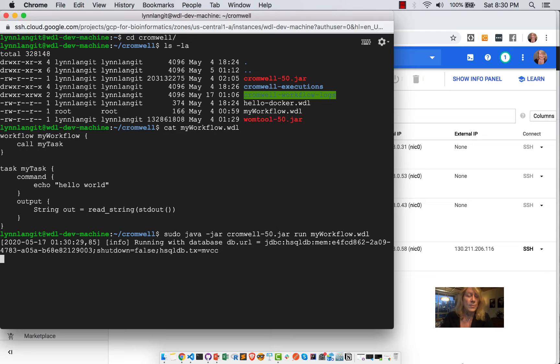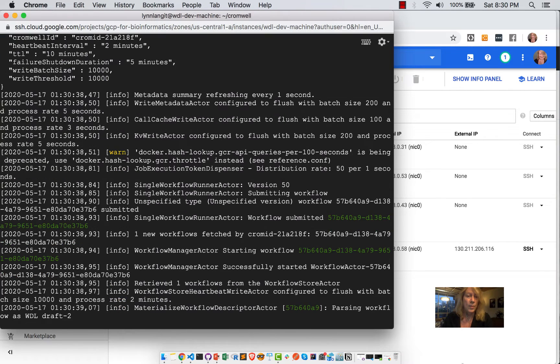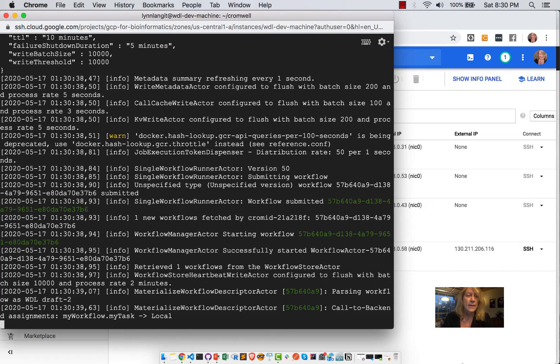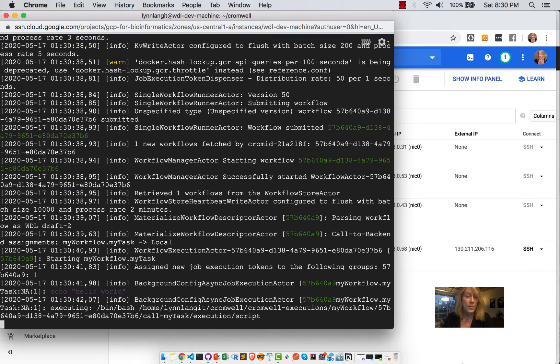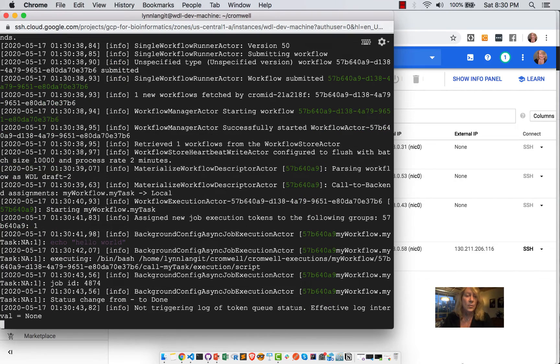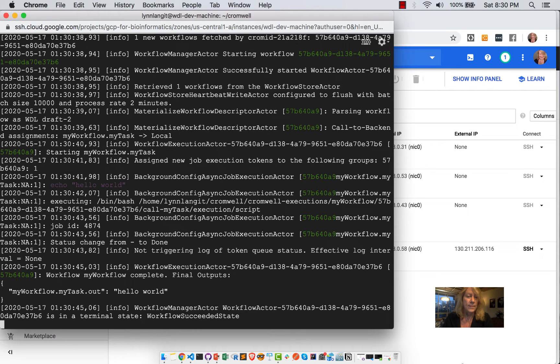Now Cromwell is pretty verbose. And so I'm just going to show you the highlights of the output when Cromwell runs. Again, I will remind you we're in run mode, so we're running a single workflow here. And we're running it on this machine.